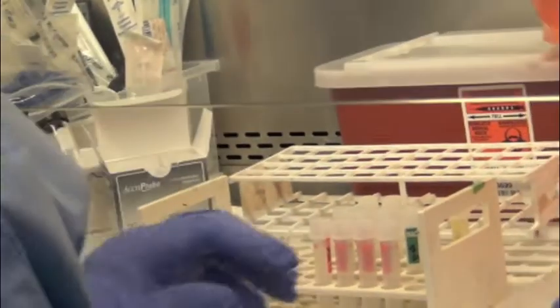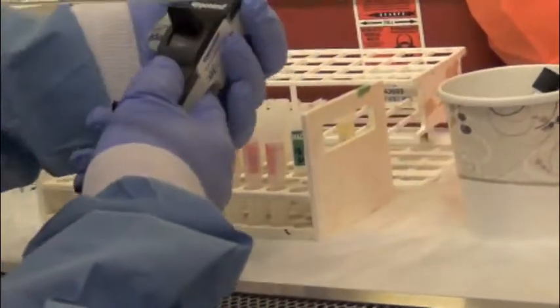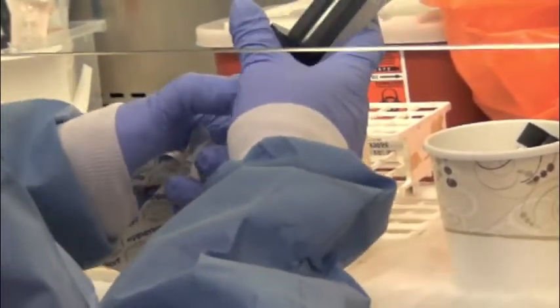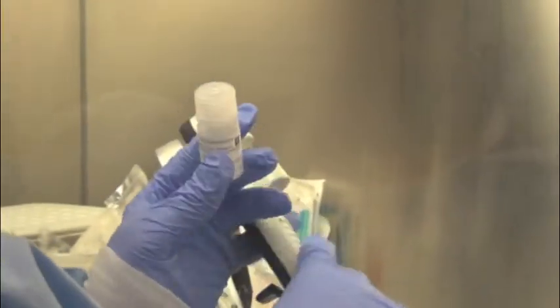Okay, so what I'm going to do now is add 100 microliters, or 0.1 mL, of our reagents. Now, the way it works out is we have a reagent 1 and a reagent 2, and I keep this on this block because the heat keeps it in solution.